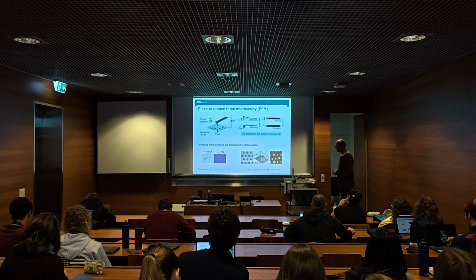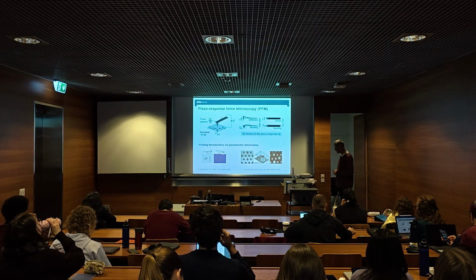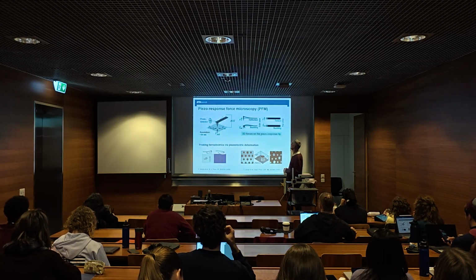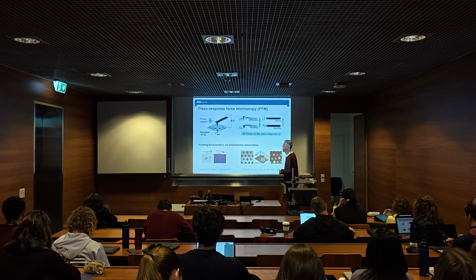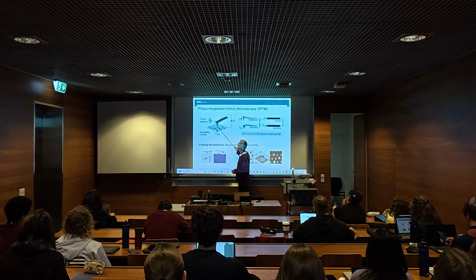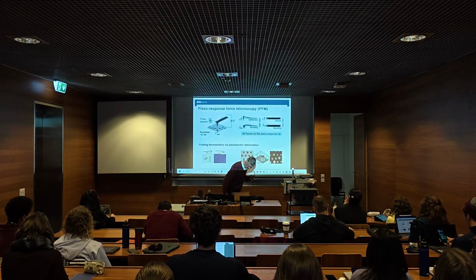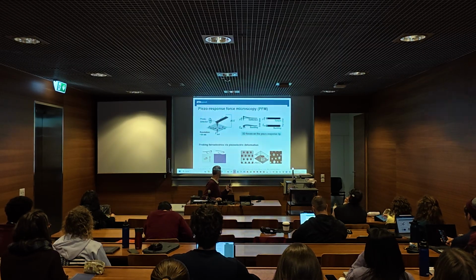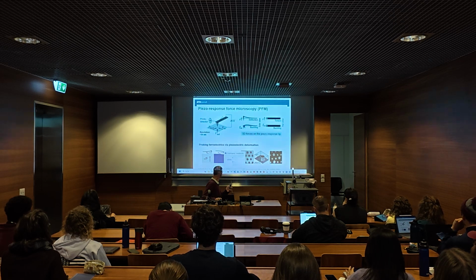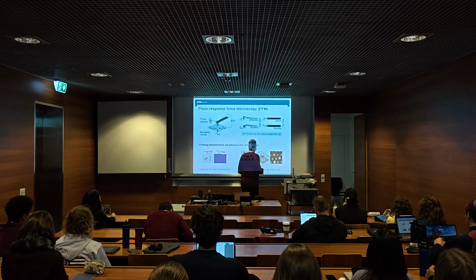Aside from atomic force microscopy, possibly the most often used mode is piezo response force microscopy. What happens here is the following. You apply a voltage between your tip and the surface. What happens?